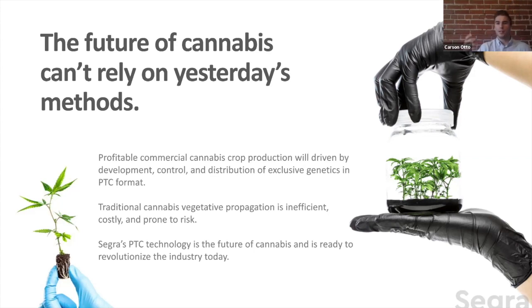We have another one about flowering cannabis plants. Can you take a plant that's in flower and initiate it back into tissue culture, back to vegetative growth effectively? The answer is yes. We just developed a technology where we can regenerate from the immature flower bud. Again, the process is that we also test the DNA fingerprinting for true to type, and we do the virus test if possible. A pathogen test to see if any virus is present in these cases, because these are non-meristematic tissue cultures. Yes, we can do it from flower buds.